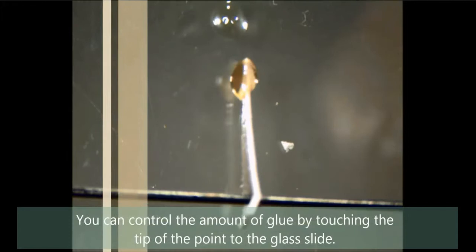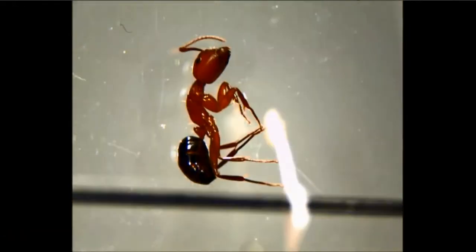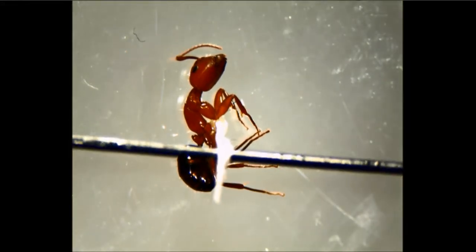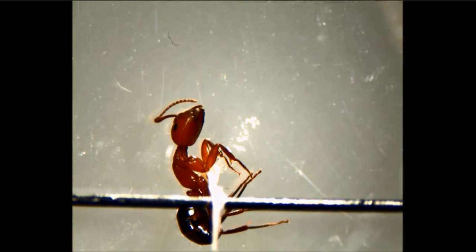If you get too much glue on the point, you can just touch it to the microscope slide — we have thousands of slides, so don't worry about that — and that will control the amount of glue. Back to our carpenter ant: we're just going to glue right up under that area. Big ants will have a tendency to kind of sag off the point, so you need to watch that. If the ant starts to move when you lift it up, you need to let the glue sit in place for a few minutes before you actually pick the ant up.